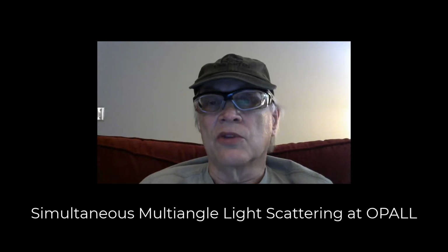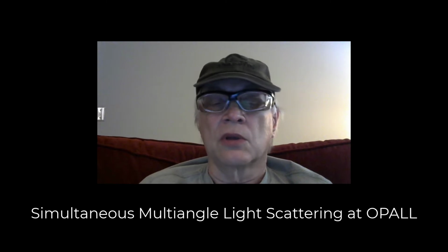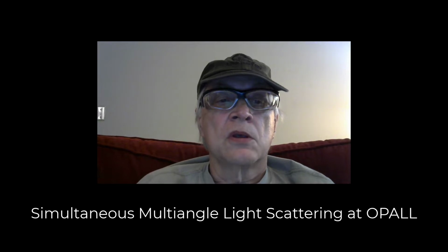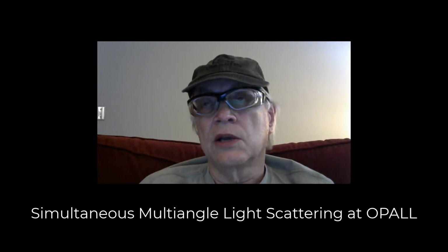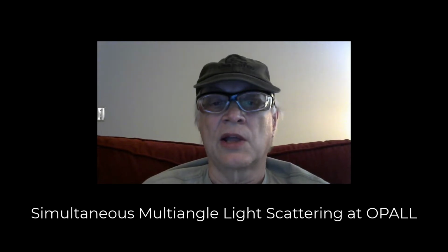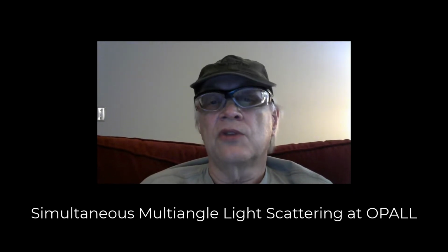Unlike our other DLS instruments, which also can do SLS, the embedded laser in the SMALS apparatus is self-contained, so it's quite safe to use. The SMALS instrument can record DLS and SLS signals using 8 APD detectors, avalanche photodiode detectors, plus another 8 simple diode detectors. Altogether then, there are 8 channels of DLS and 16 channels of SLS. Today we're just going to illustrate the DLS side.